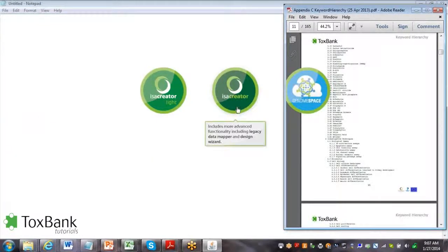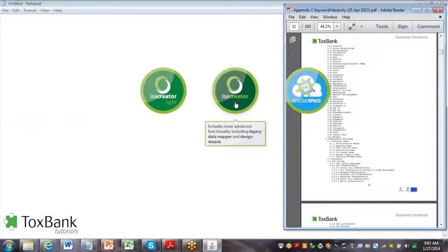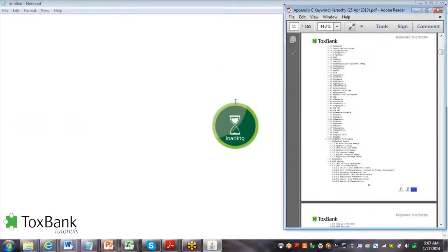There are three options and generally the middle ISA Creator option gives the most flexibility, so I'll use the ISA Creator option.